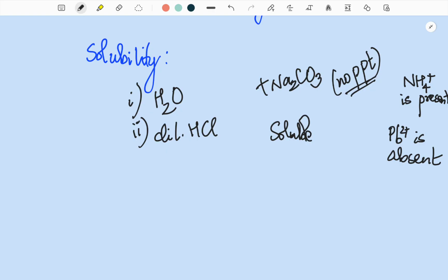The flame test is actually a confirmatory test for the cations, and I will be explaining the flame test in that video where I'm going to explain the confirmatory test of cations. In this video, we are not doing that. But let's say in case in your school, your teacher has told you to write flame test in the preliminary observations, then please go to the part where I am explaining the flame test, and you can learn the flame test from that, and you have to write it in the preliminary section.